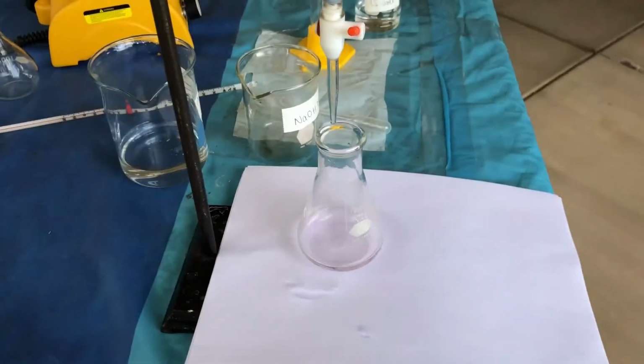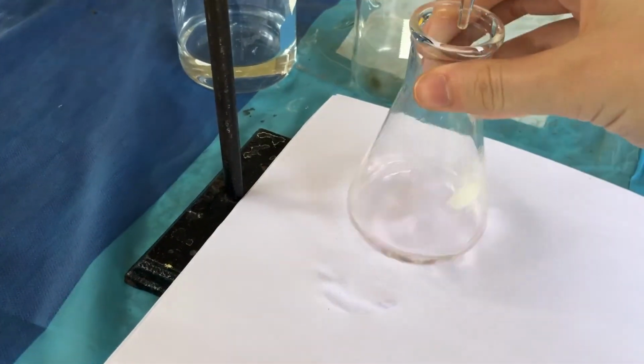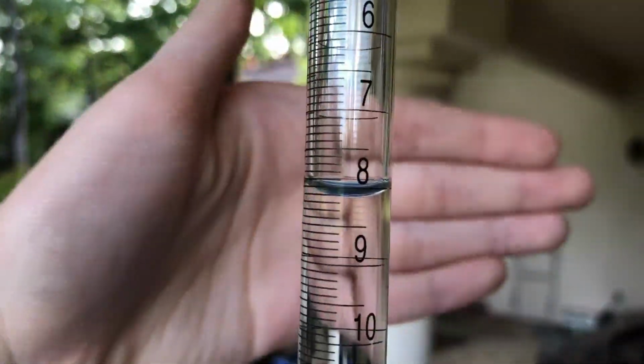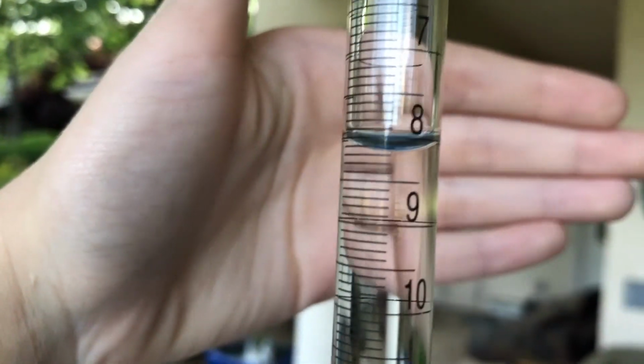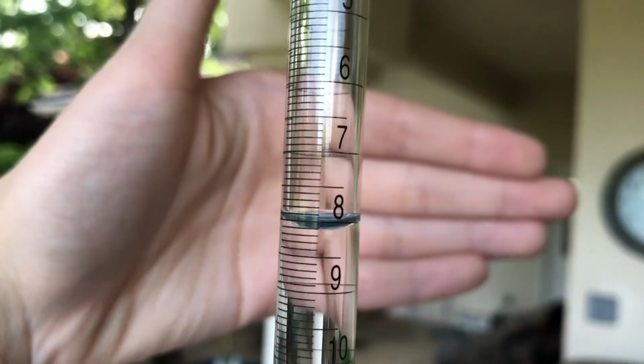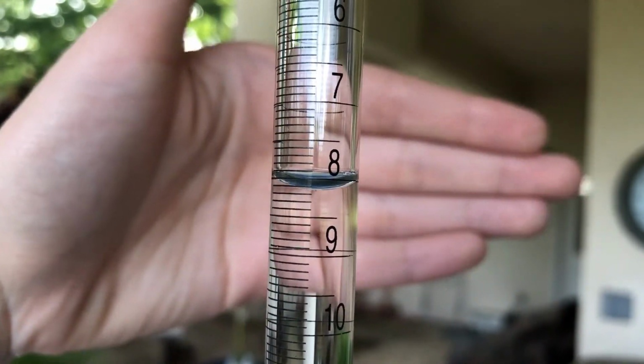Okay, so I think we have reached the end point. We check it against white paper. It should be a very, very light pink. Look how good Andre did. So now we're going to record our final volume. And this is for you to read. Hint, look at the bottom of the meniscus. And there you go.